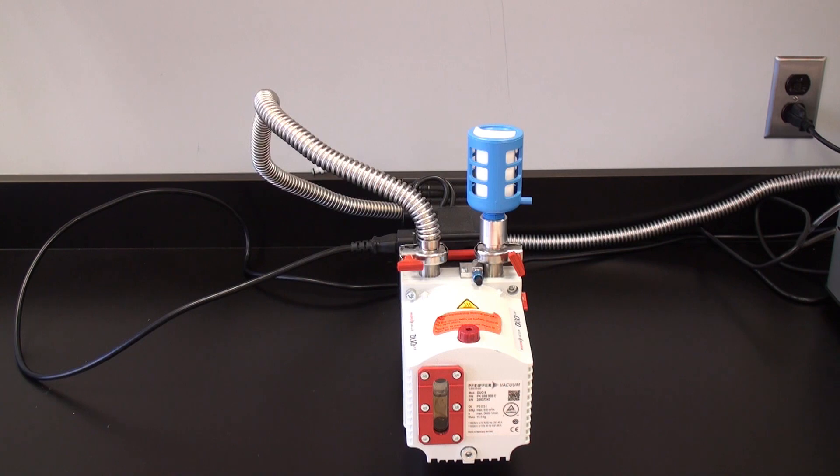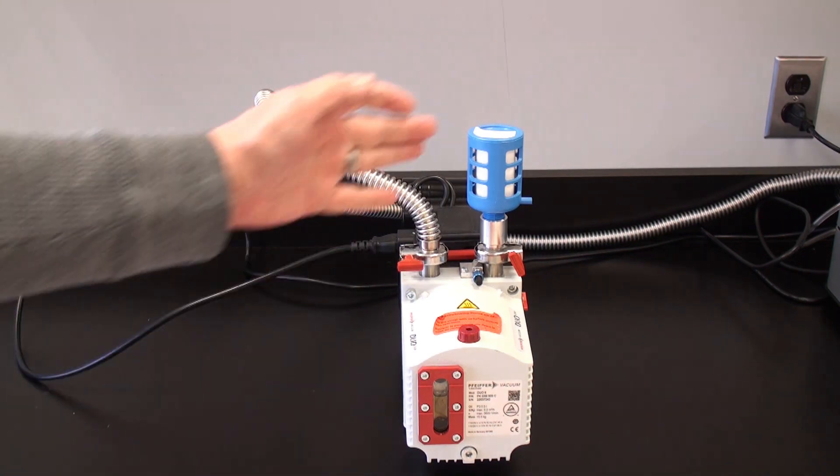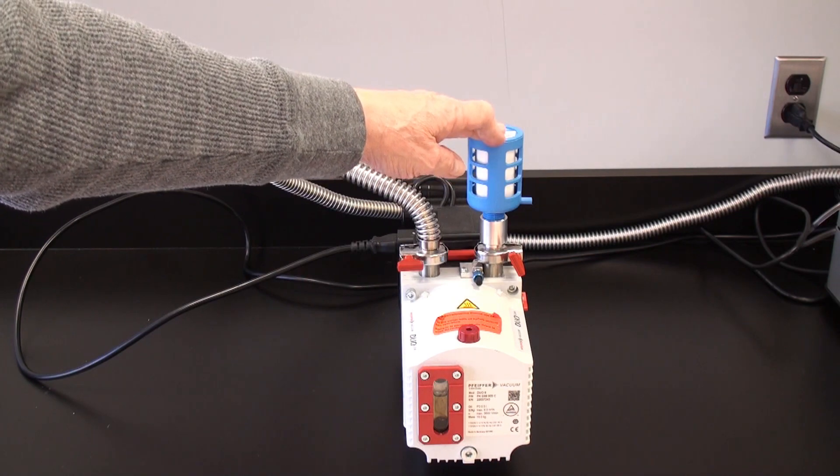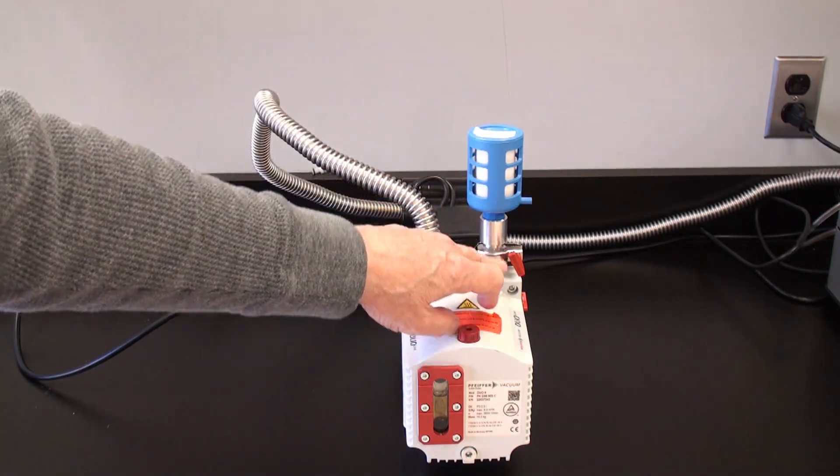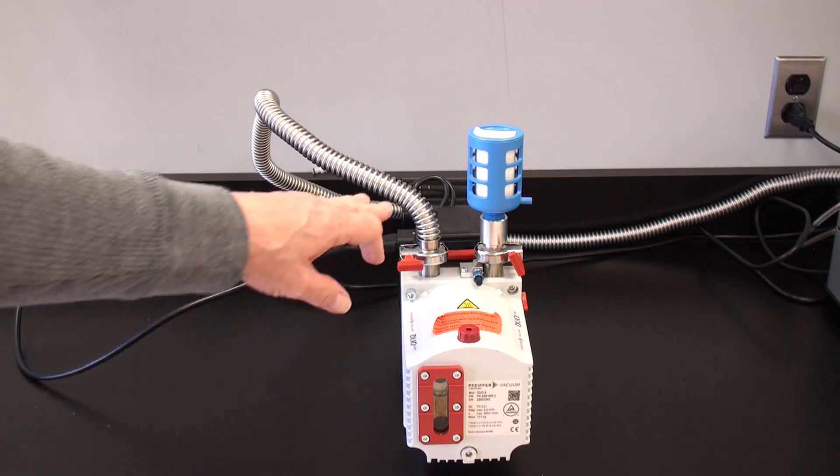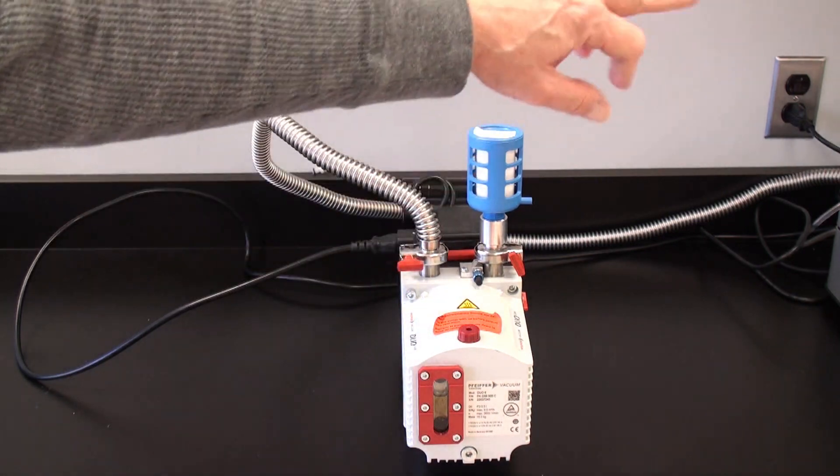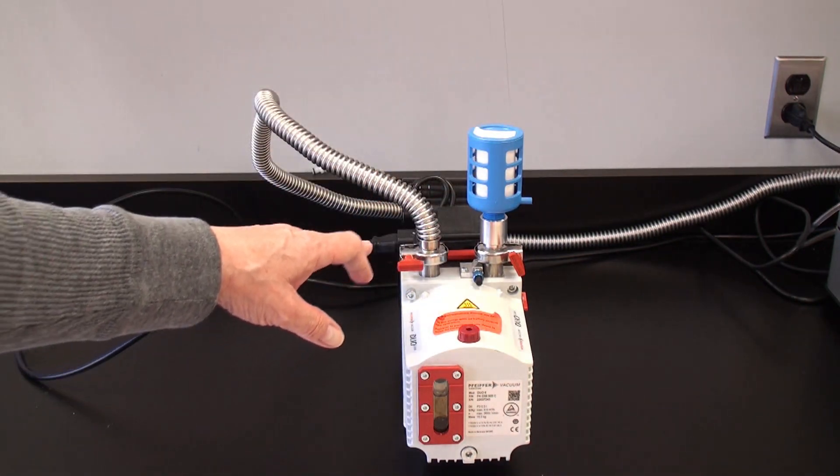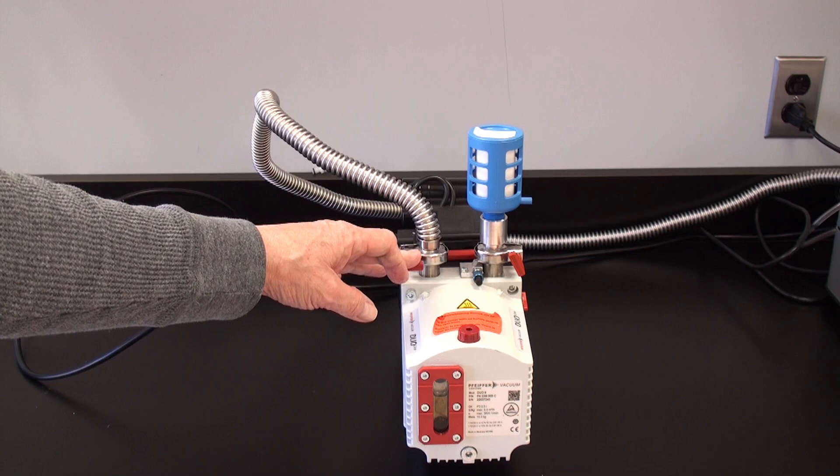This is the Duo 6 pump which is usually purchased with the instrument. You can see the blue oil mist filter mounted in its adapter on the right hand exhaust port from the pump. You can see the vacuum line which goes to the MiniQS attached to the left hand port.